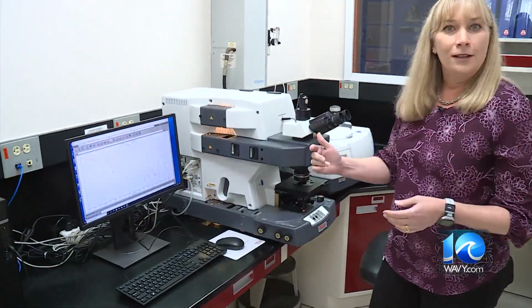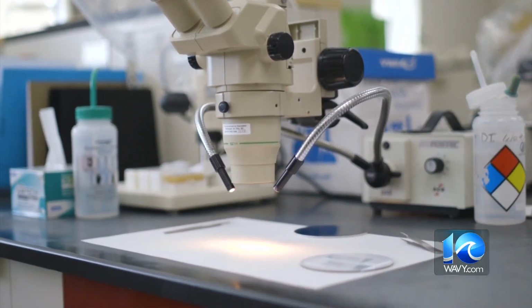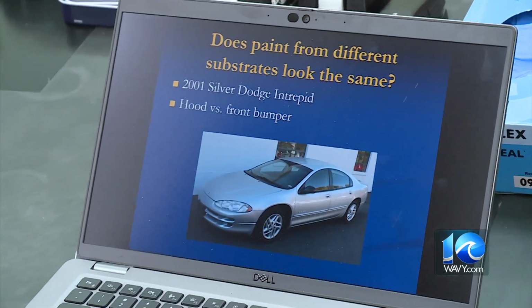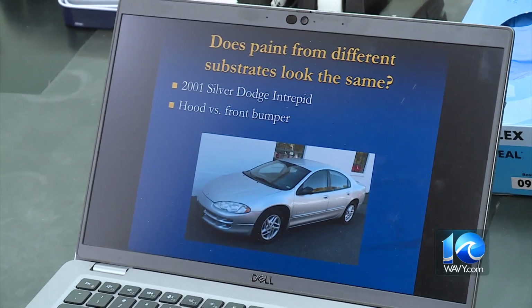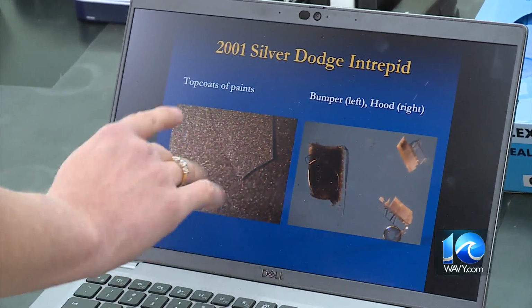While Christie says there will never be a complete match, they can get pretty close. And the process from scraping clothing to the PDQ can take a few days to a week. We look for the car's cousins in the database, because it's not that car, it's not like a DNA database. Yeah. We're looking for something else that was made at that factory in that time period. The information is shared with police, and a suspect, Christie says, is caught in about a quarter of cases.